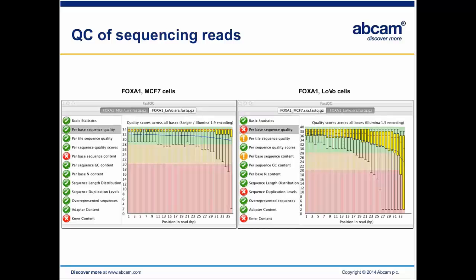The second metric is read quality. In this graph, the x-axis shows all the individual bases from the reads. For every base, the y-axis is the box plot of distribution of quality scores of all reads across that particular base. The yellow boxes show from 25th to 75th percentile, and the red line indicates the median, and the blue line indicates the mean of the quality scores. You really want the quality scores well above 20 to be good bases.